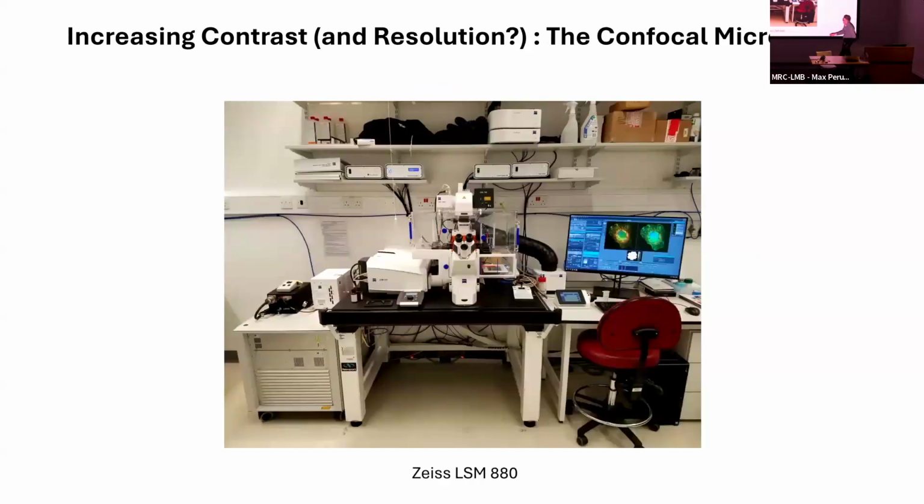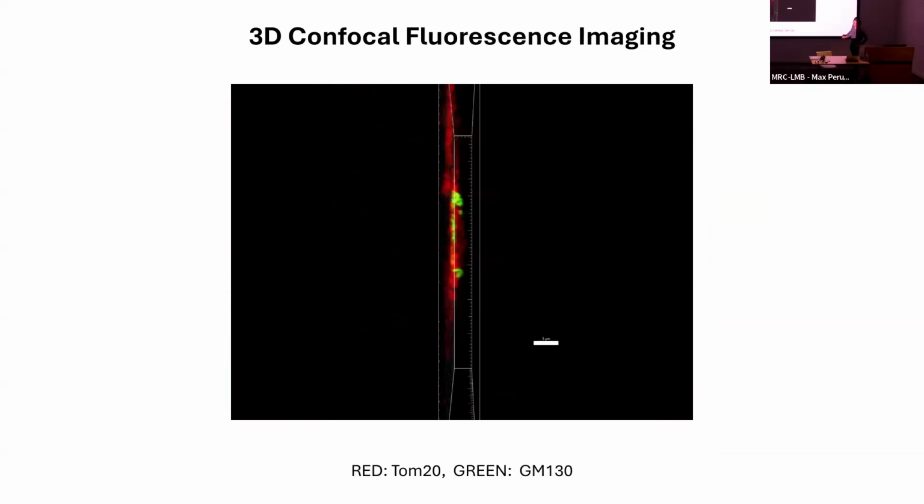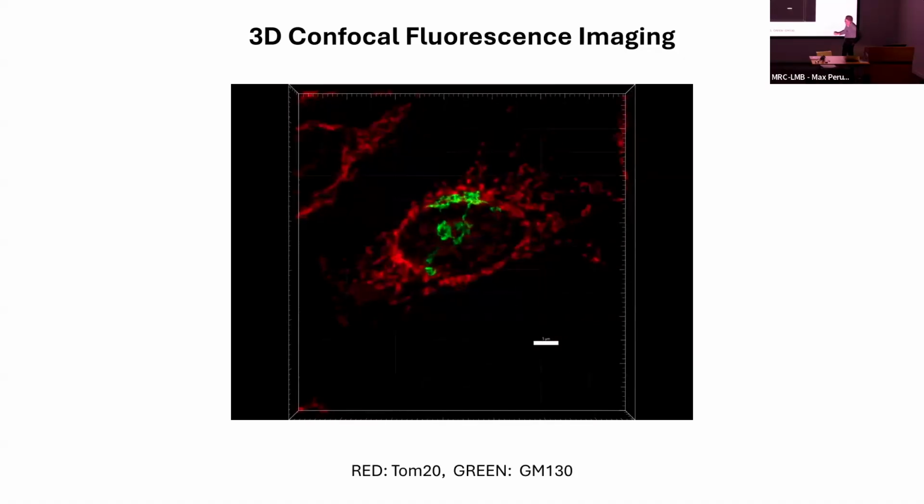Yeah, that's a confocal microscope. The confocal bit is that box on the side there. So that essentially is just a point scanner. It scans the sample with a fixed focal point. The fluorescence emission goes through a pinhole onto the detector, and it generates images on the screen, just as you see there. What the pinhole does is reject all that out of focus fluorescence, so you end up with a much more contrasty image. So here the haze is gone, and also because of the pinhole, for reasons I won't get into just now, we can squeeze a bit more resolution out of the sample.